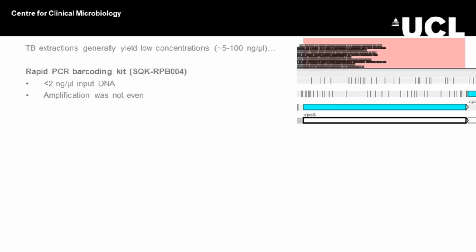And with Nanopore, we found, because it uses generally native DNA, don't PCR it, you need quite a high level of DNA to begin with. And then the genome itself can be complicated because it has some very high GC content and, as I said before, many repeating regions. That's all well and good if you have a well-resourced laboratory, but when you then actually have to think about other things like power and electricity, the internet, this then starts to become a little bit more complicated again.